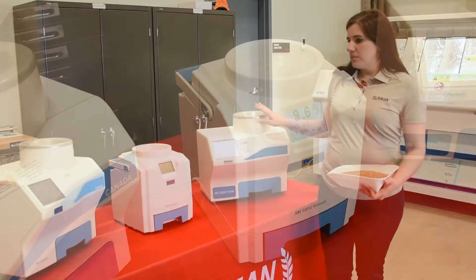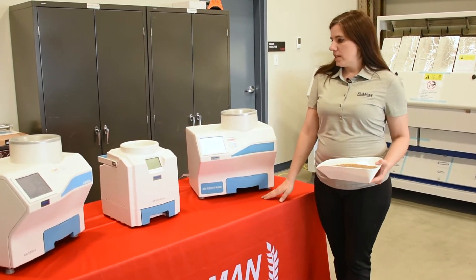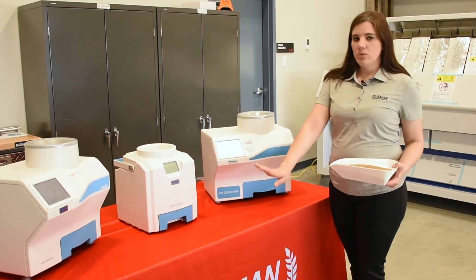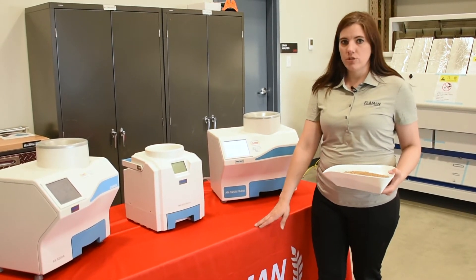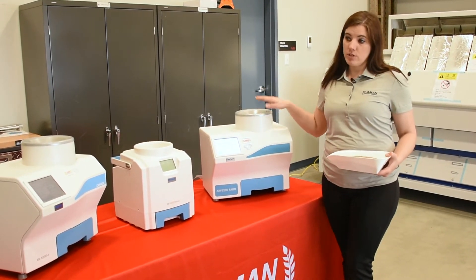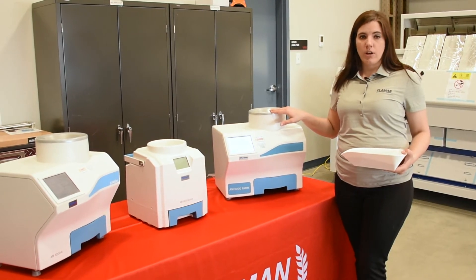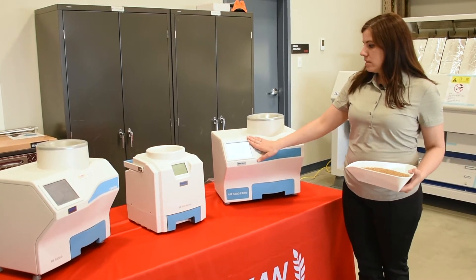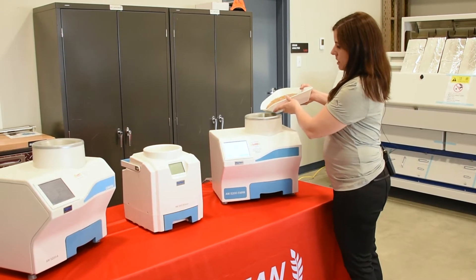The next meters we have are the 5200 meters. They're more of a stationary meter and a lot more robust than the portable unit. The 5200A is an approved meter with a few extra features, and then there's the 5200 farm unit which has a few features taken away to help make the price more affordable for on-the-farm testing. There's a list of grains that you select from, and you pour the sample in the top of the meter.